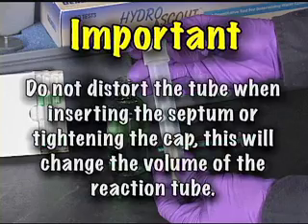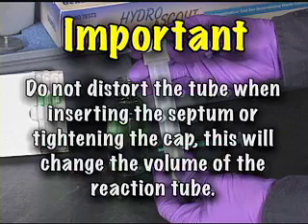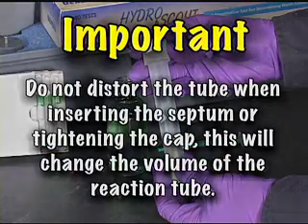Important! Do not distort the tube when inserting the septum or tightening the cap. This will change the volume of the reaction tube. Thank you.